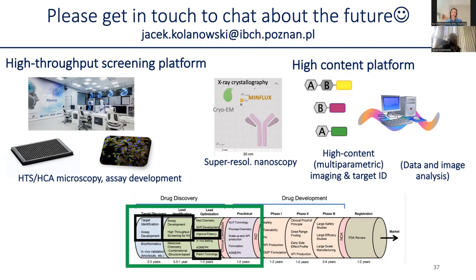So plants are generally a challenging model for optical imaging, whether it is fluorescence or bioluminescence, because of their intrinsic high autofluorescence, that's one thing. And B, because of the difficulty with the cell wall, which also affects the penetrability of the targets or substrates in the plants. I cannot really tell much about the difficulties in genetic modification of the plants. I'm not an expert in that, so you would have to ask other people how challenging that is. But definitely the challenge stems from the high background signals.